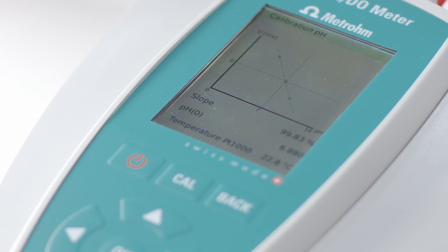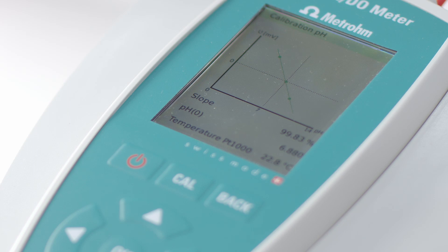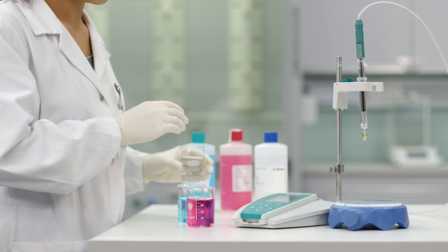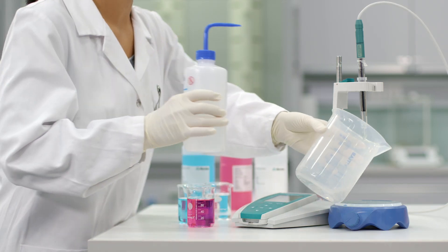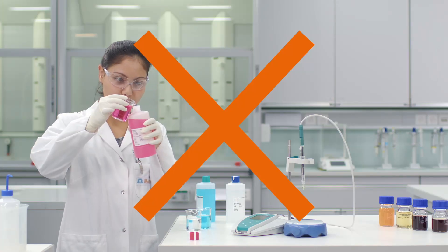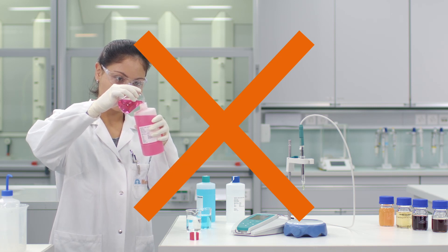Once the determination is finished, you need to display the calibration results. After the calibration is finished, rinse the electrode again with deionized water. Dispose of the buffers and do not pour them back into the bottle, as they are contaminated.